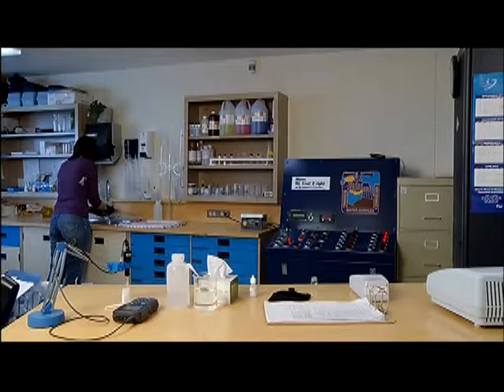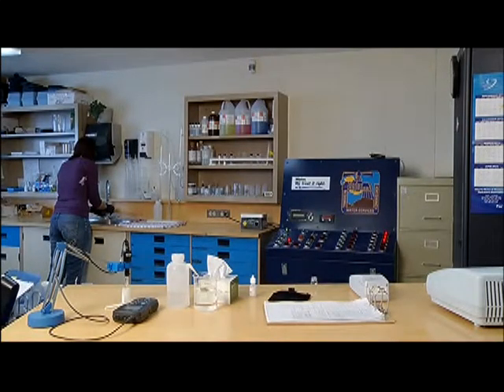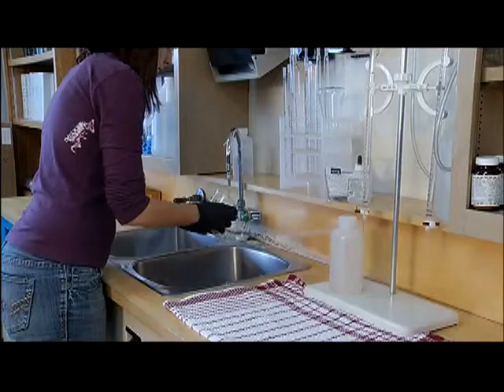After the water has flushed for the prescribed time, rinse the container you'll use three times to remove any contamination and to get a fresh sample.